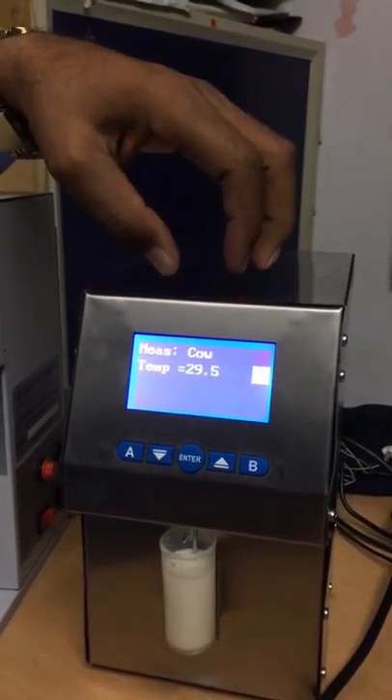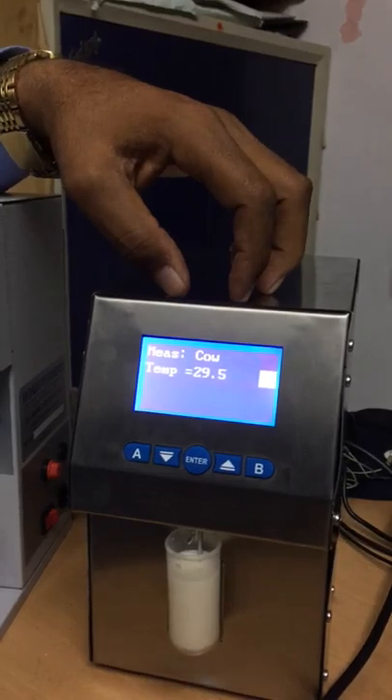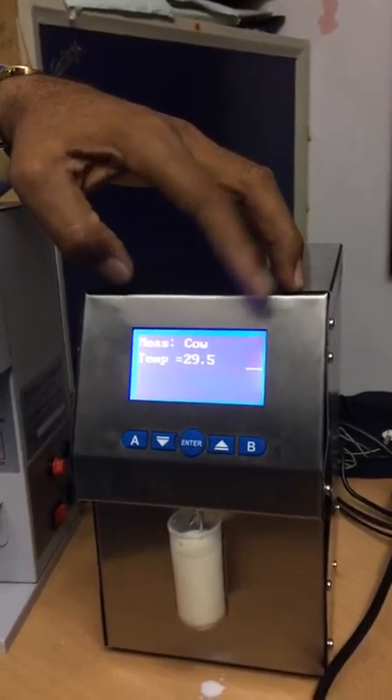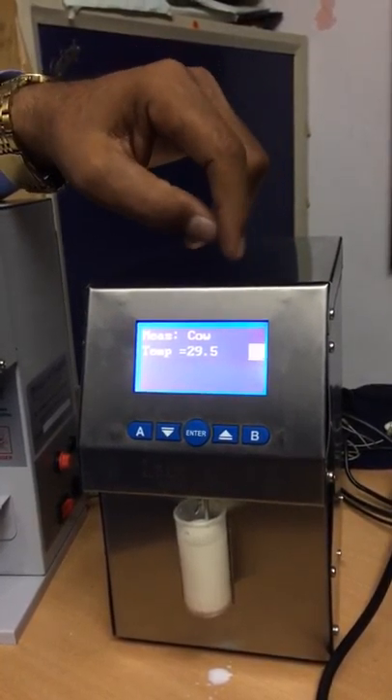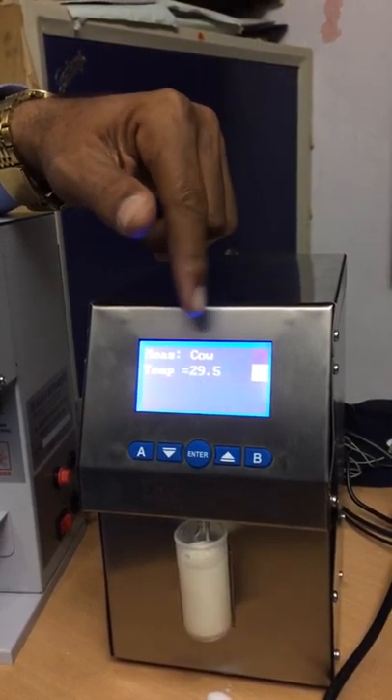The measurement mode is cow milk. This analyzer has three channels: you can use it for cow milk, buffalo milk, and mixed milk also. I will show you how to select the different channels in a few seconds.